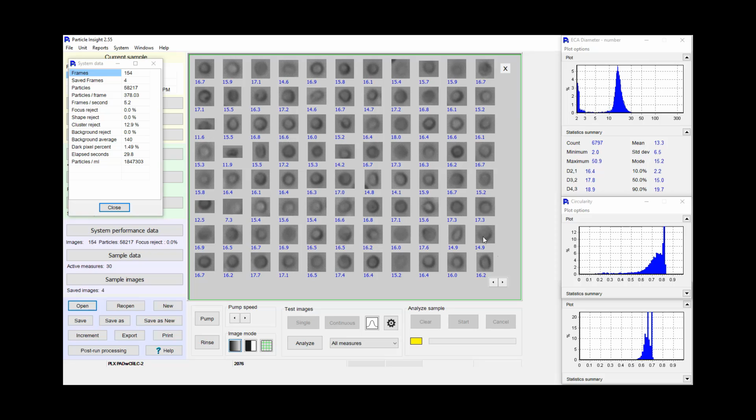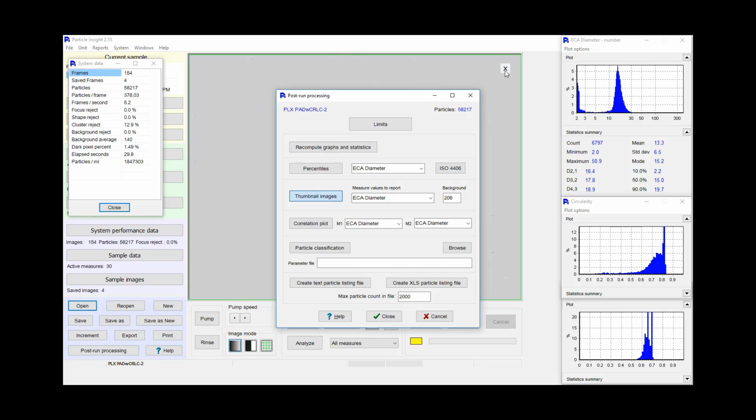This is way too much information, just scrolling through these thumbnails. It doesn't quantify anything for us. It's just qualitative information. What I tend to do once I look at all the different thumbnails, to see what all these stem cells look like, is go in and start making some assumptions. The first assumption I will make is to look at the correlation. One of the things I'll do first is try to make a general assumption.